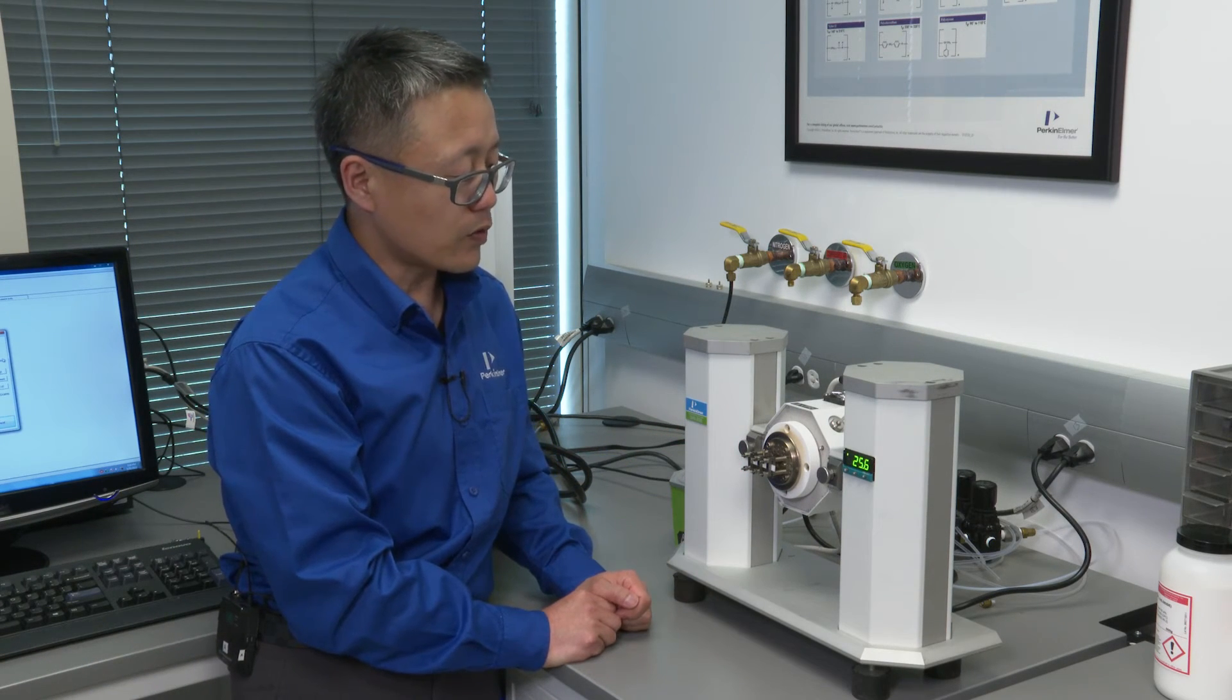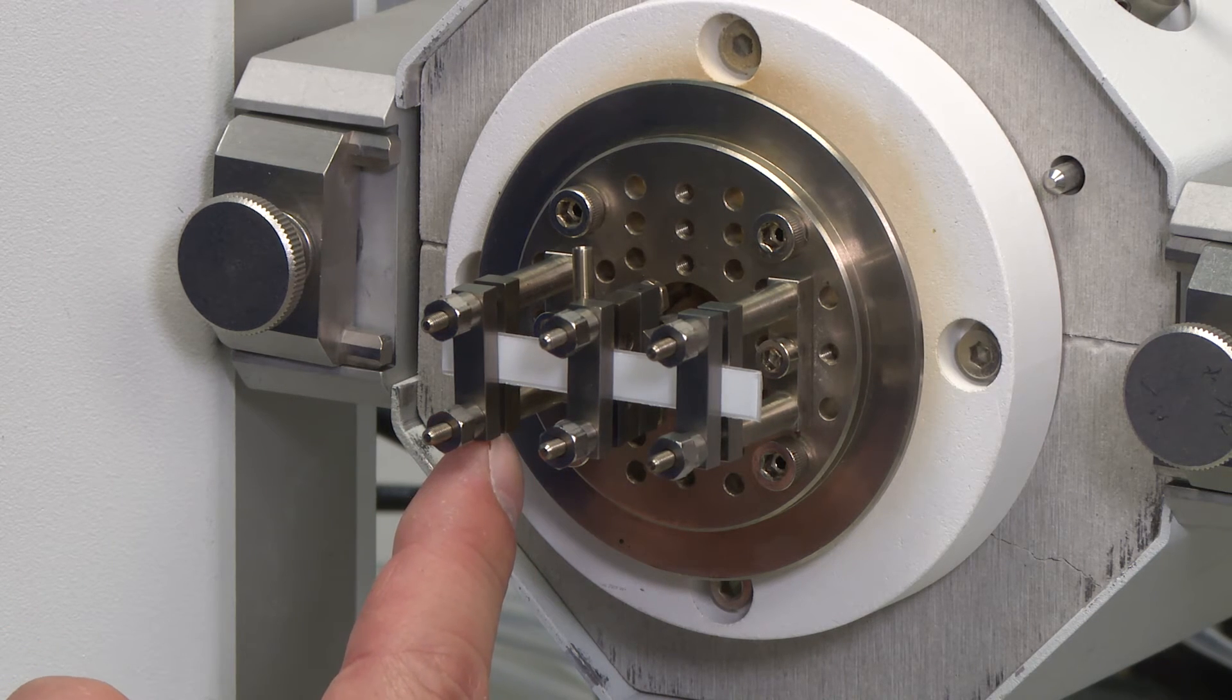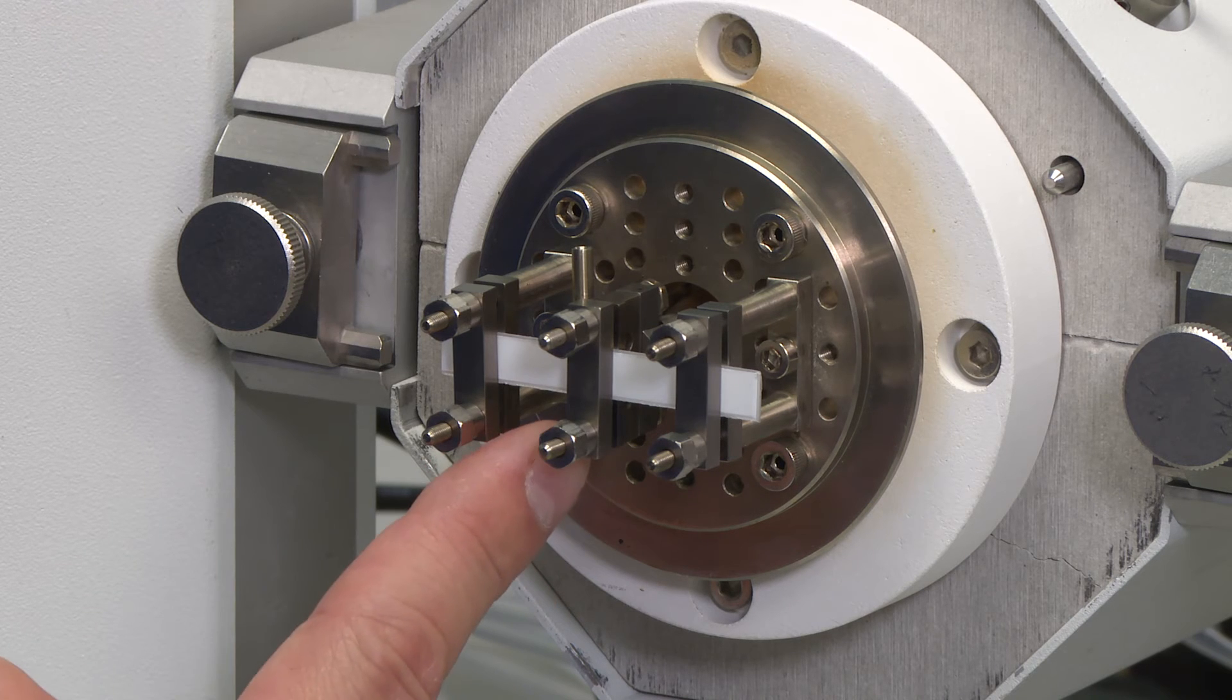Now you can use the caliper to measure the sample length. The sample length for dual cantilever bending is between this edge of the fixed pillar and this edge of the moving probe.